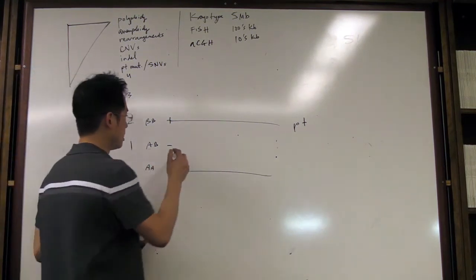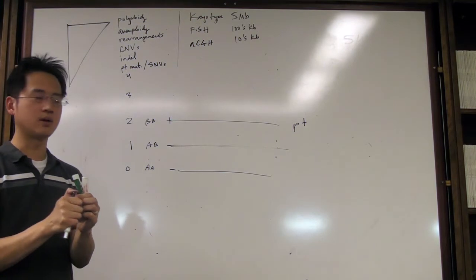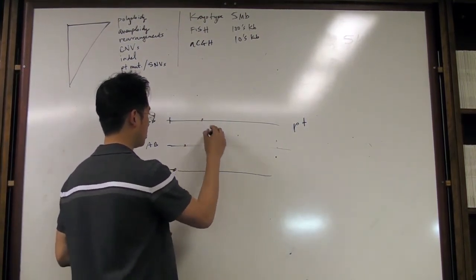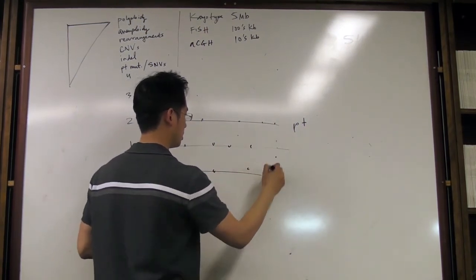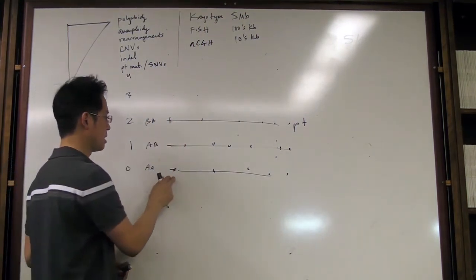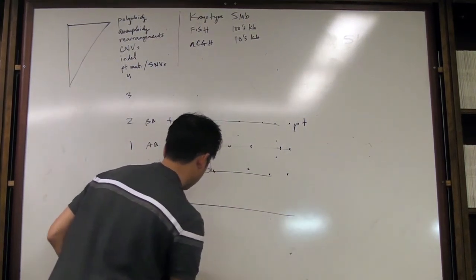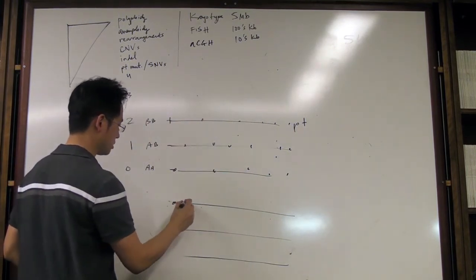So typically, because of the Hardy-Weinberg equilibrium status of those SNPs, it's very rare to see someone who... most people would look like this, where it's almost randomly distributed. Sometimes it's AA, sometimes it's AB, BB, etc. It's very rare to have a situation where someone would show this.